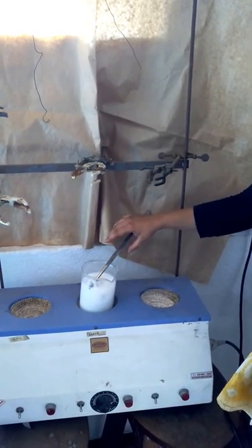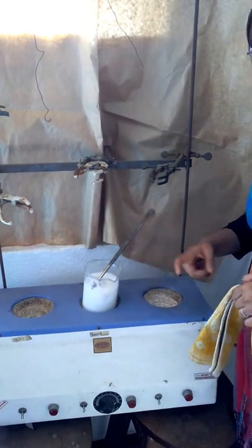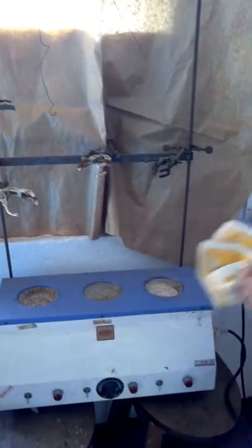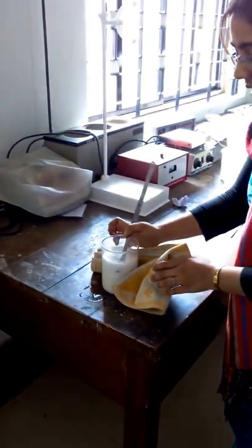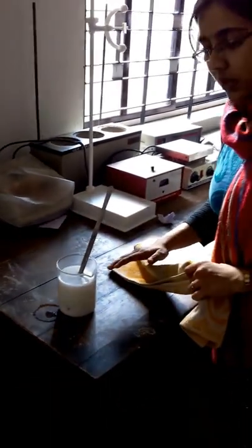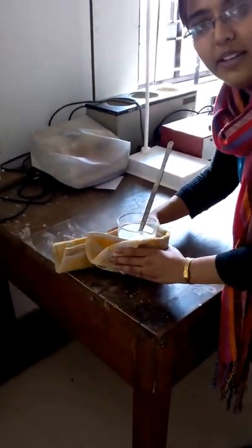We will keep the bag dipped in the cow milk and keep it for 15 minutes or until it boils. As we see the boiling begin, we will very carefully remove the beaker from the heat and keep it for 15 minutes. After it cools down, we will repeat this process.